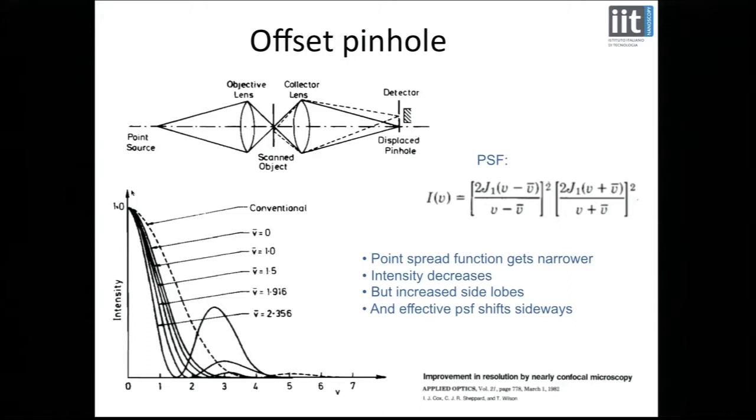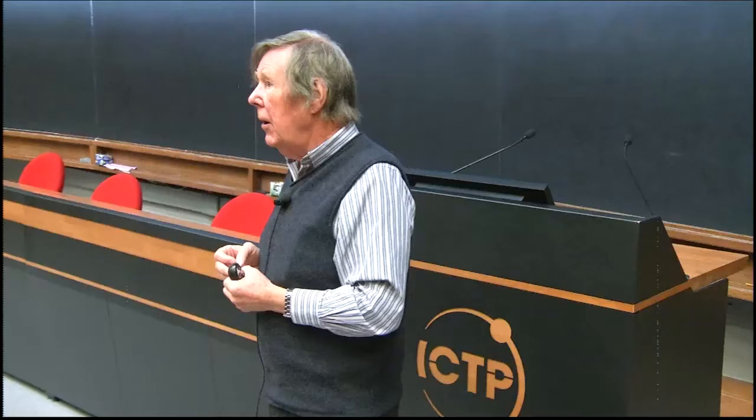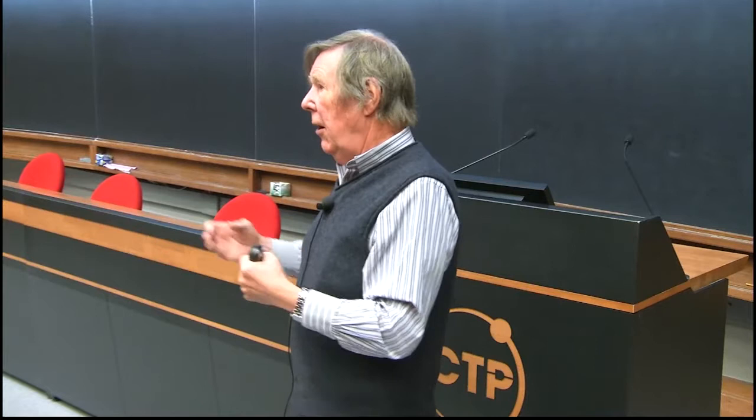In 1982, he published this paper where I remember he came to me one day and he said he was building a confocal microscope as part of his PhD. And he said, how do I align it? How do I know when it's aligned? Now, people who have actually done this themselves would know that what you do is you align it to get maximum signal, basically, right? So the pinhole is aligned to maximize the signal.